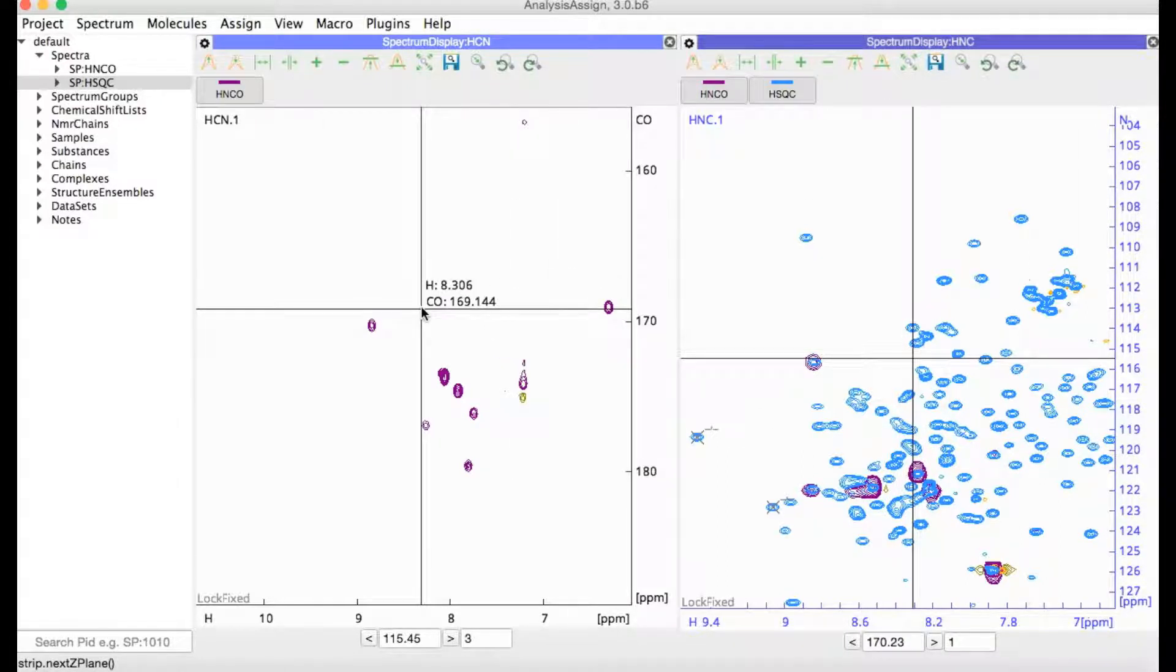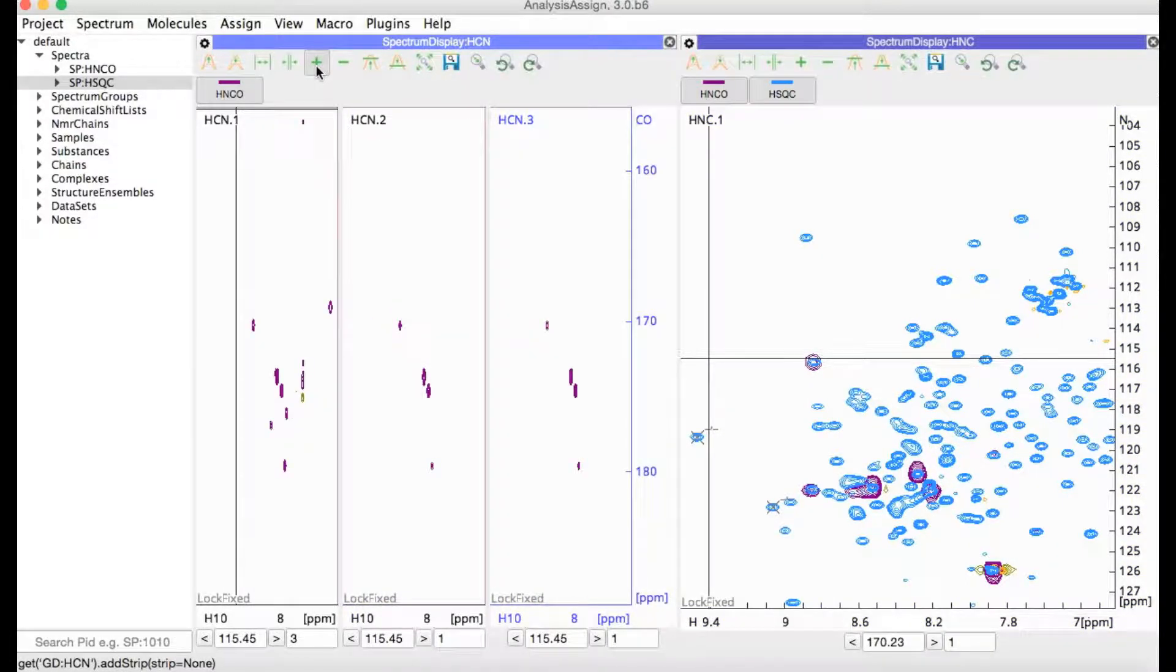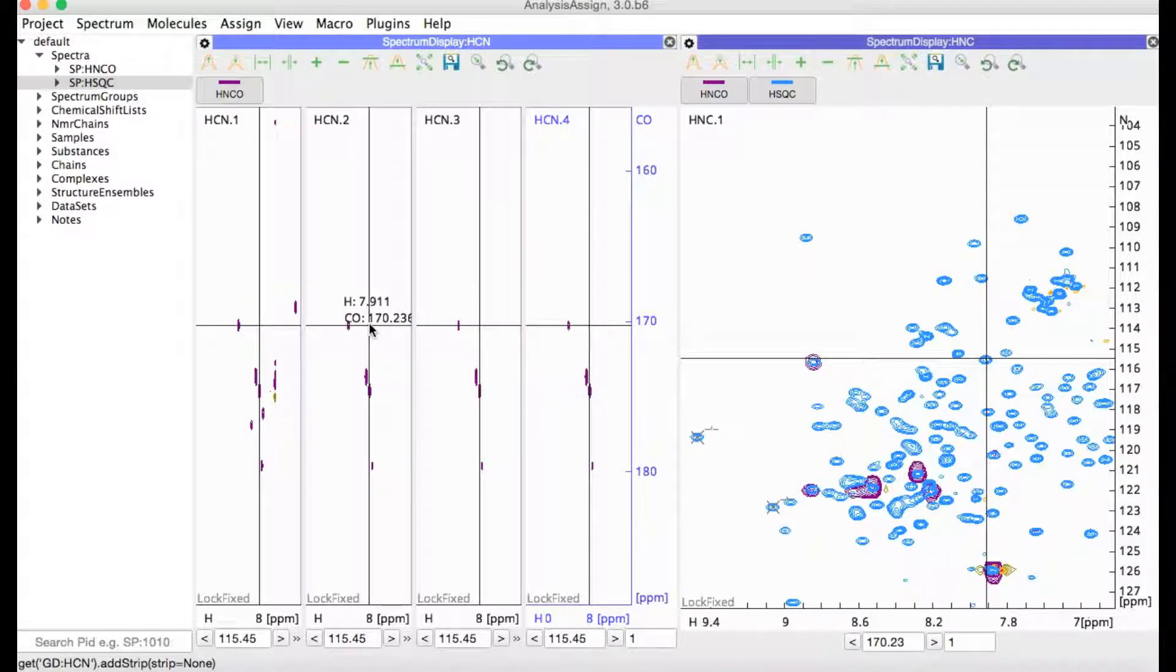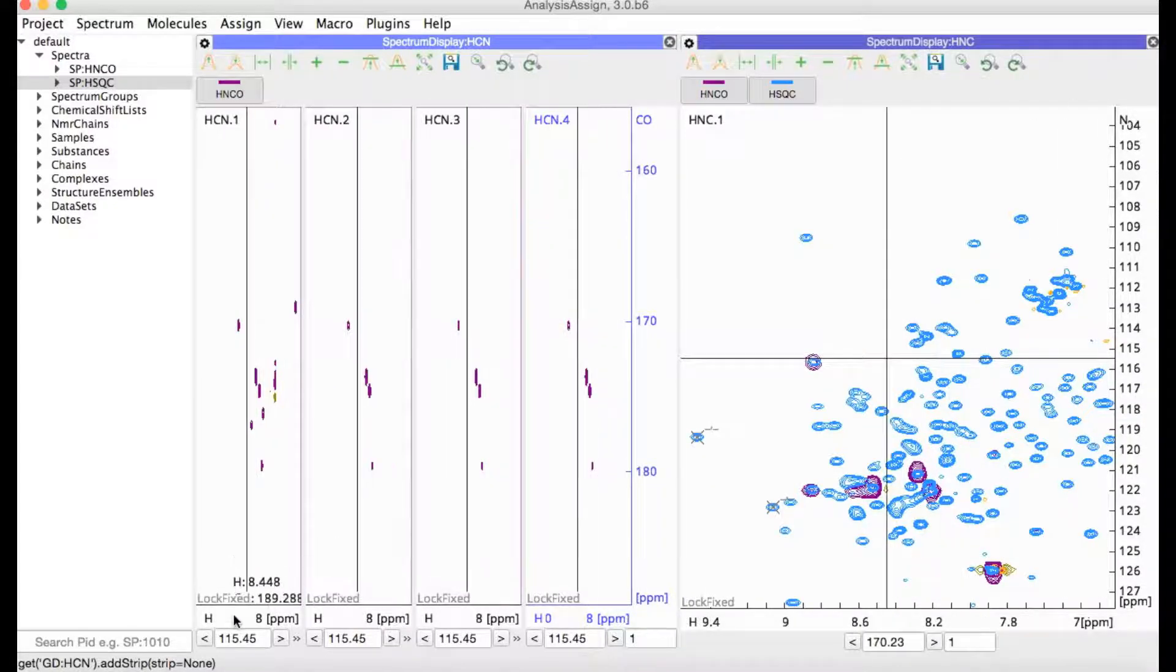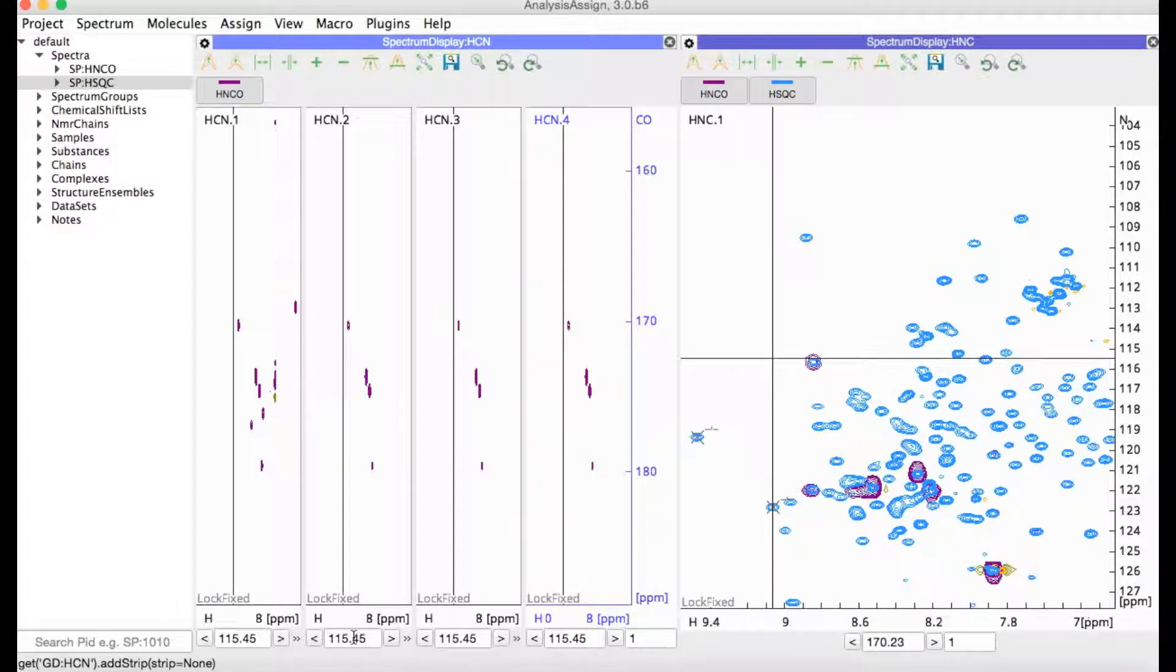You can add strips to one of these displays simply by pressing the plus button in the toolbar. This will add strips to the display. You can see that the proton and nitrogen dimensions each have the capacity to have their own values.